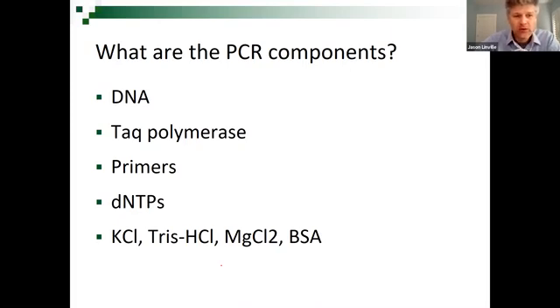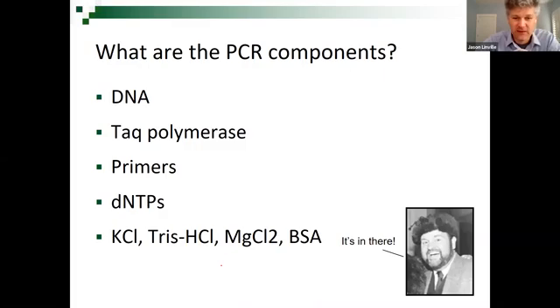Okay, so we're going to go through each of these components, and I'm going to give you a little bit extra information about them. So not only do you need to describe what they do in a PCR reaction, but also there's a little bit extra information about each of these things.